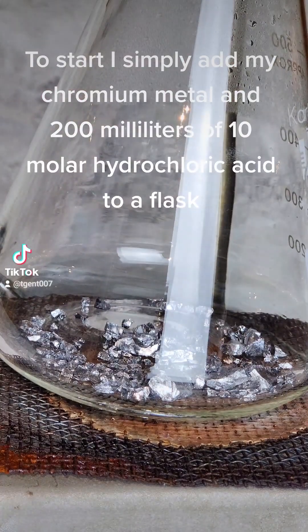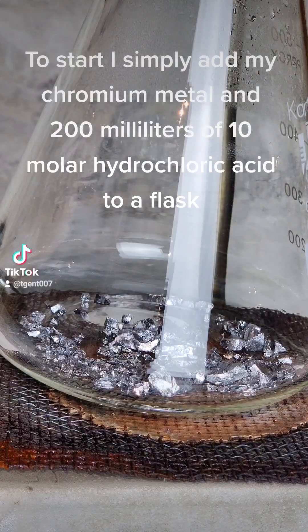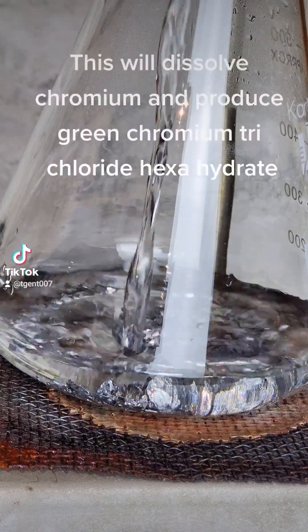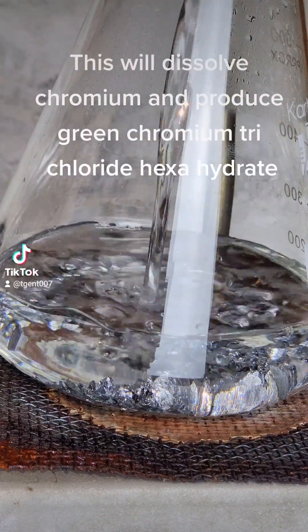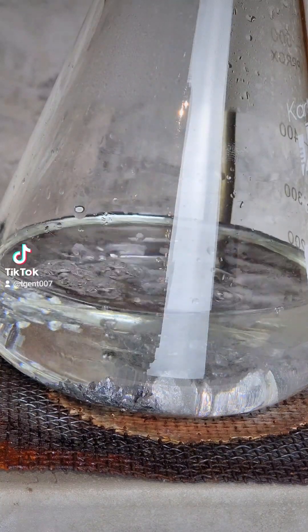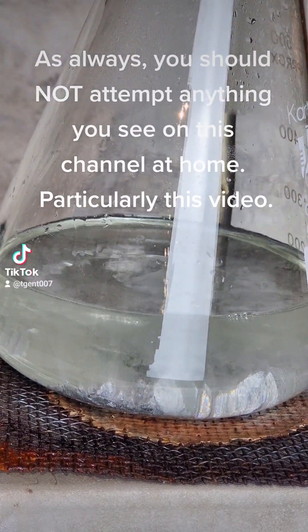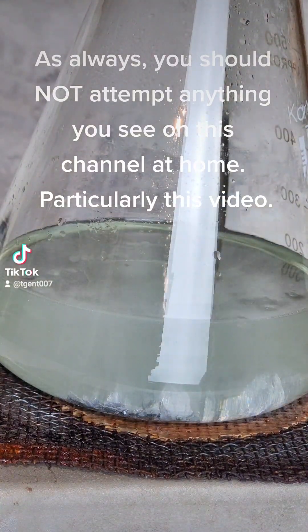To start, I simply add my chromium metal into 100 milliliters of 10 molar hydrochloric acid in a flask. This will dissolve chromium and produce green chromium trichloride hexahydrate. As always, you should not attempt anything you see on this channel at home, particularly this video.